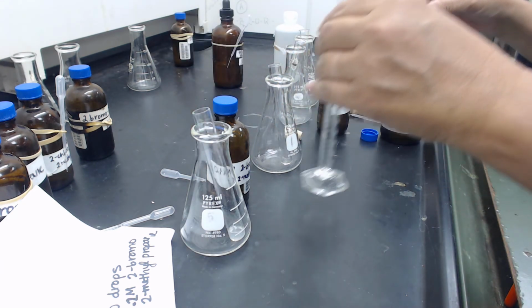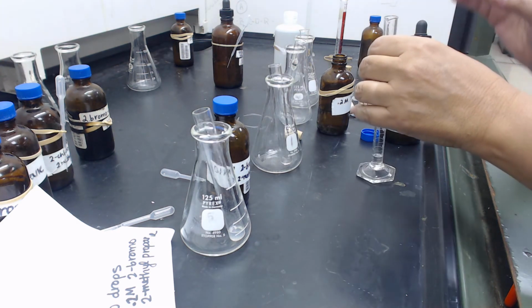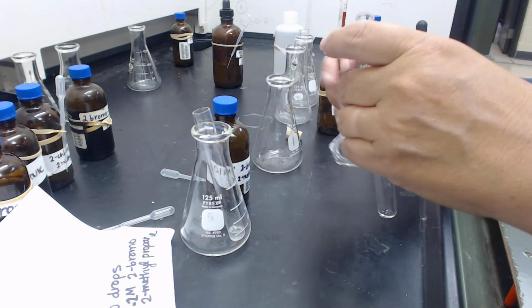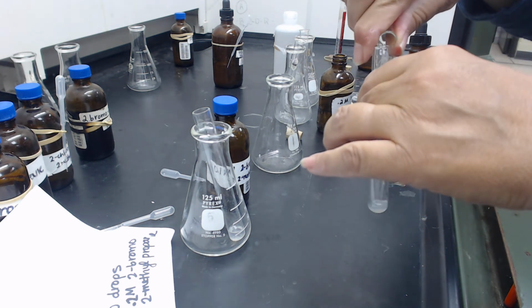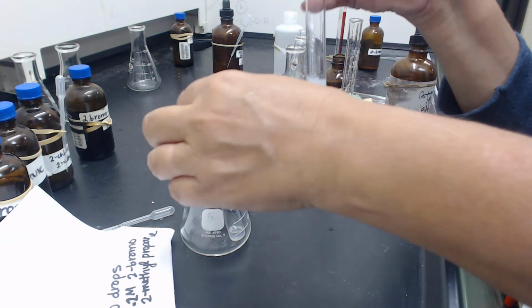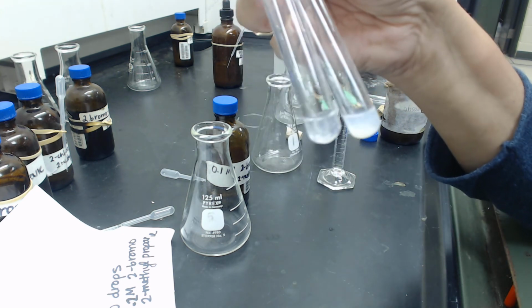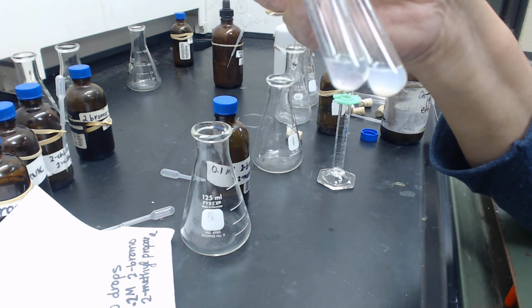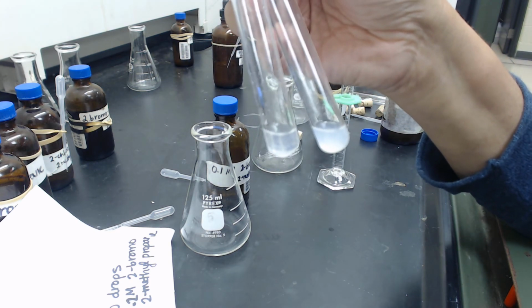I'm going to do the same thing. It's a little bit hard to do. Again, I'm going to start the stopwatch just as I pour it. Now that one happened within 3 seconds, and if you can see it, the one with the 0.2 molar is already much faster. It's formed definitely more precipitate, almost twice as much.